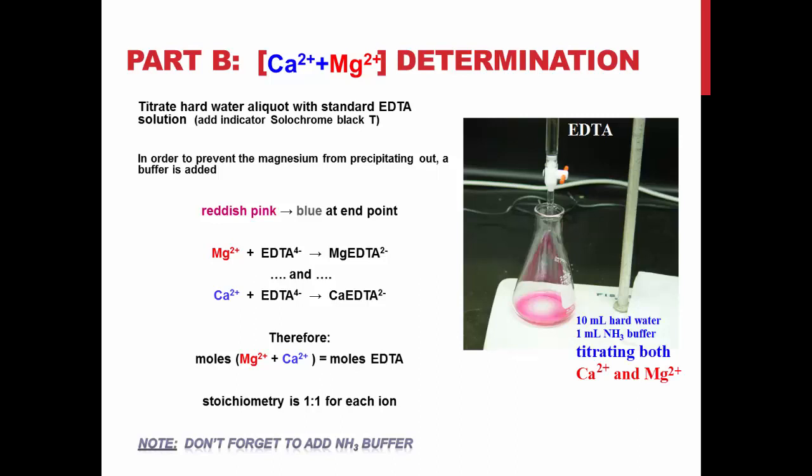Note that we will be having 10 milliliters of hard water, 1 milliliter of ammonia, and we will be titrating for both calcium and magnesium.